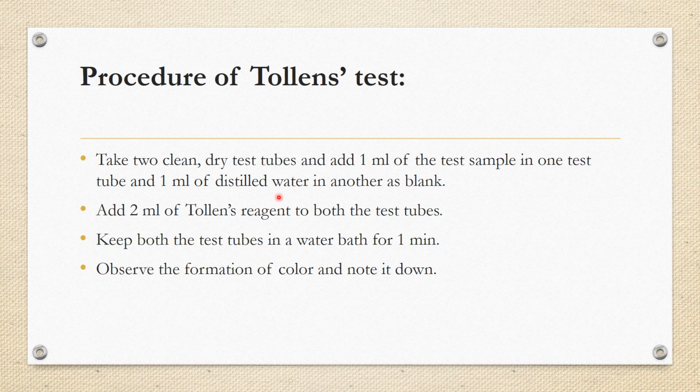In another tube take 1 ml of distilled water without any sample, and mark it as a blank.